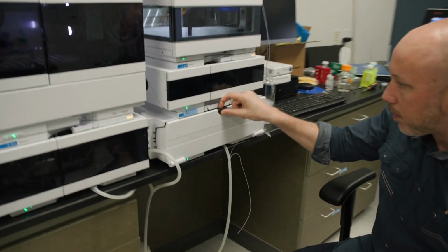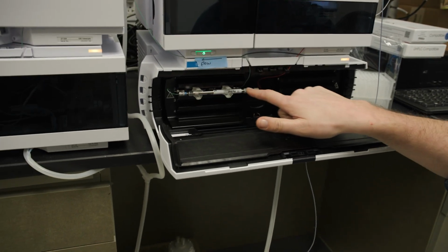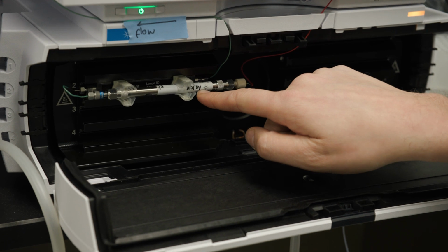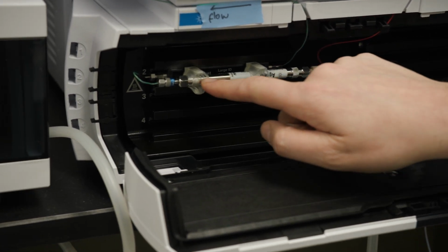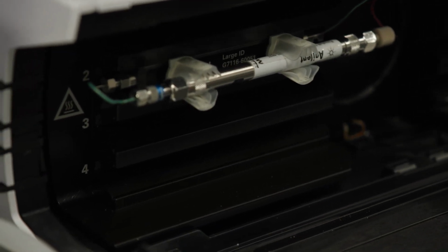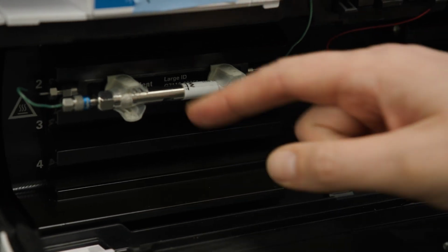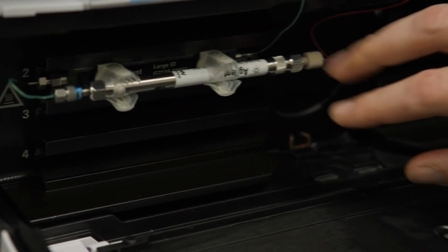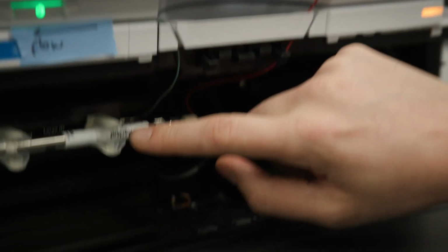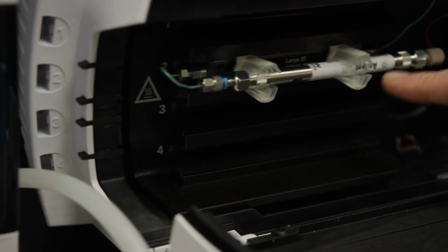So one scale that we do is on kind of our high flow scale. And so you can see this is a chromatographic column where we'll pump our analytes through here, and they'll basically interact with the hydrophobic resin that's on the inside of this. And depending on their type of chemistry, they might interact more and slow down, they might speed up and go through, but they'll separate at different times. But basically what I want you to see is the size of this column, okay? So this is doing kind of a large scale, what we would call large scale liquid chromatography separation, okay?